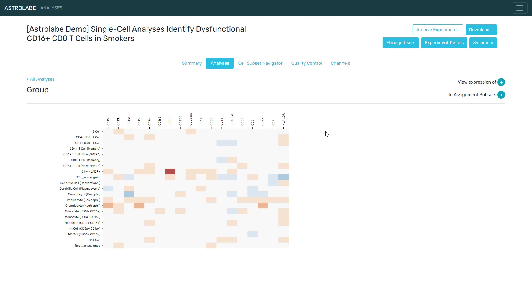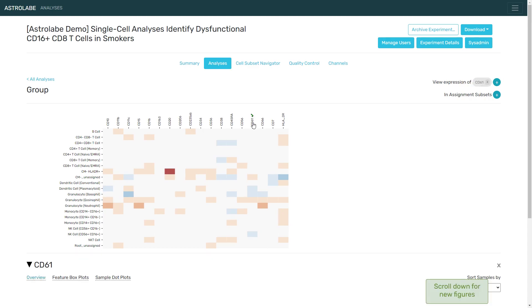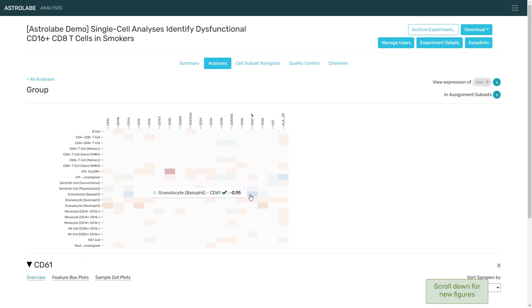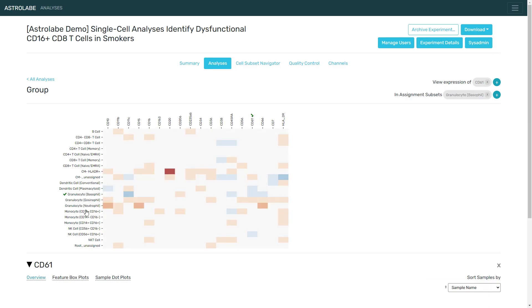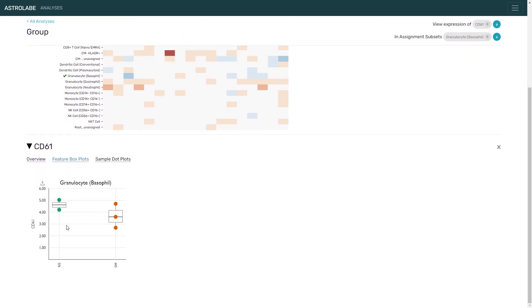One trend which I found interesting when looking at the heatmap is if we examine CD61 in the basophils, it seems to decrease between the non-smokers and the smokers. Taking a closer look, there seems to be about a 15 to 20 percent decrease in the expression of this marker, which could indicate less of a response within the smoker population.